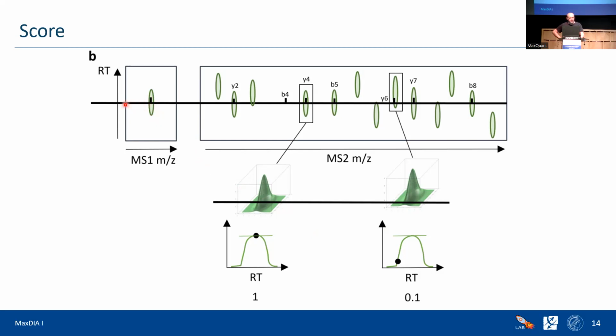And then also for all of the fragments in the library spectrum, do we see a feature in the particular plane for this isolation window? Do we find features that overlap with this retention time, mass and maybe a collision cross-section value?